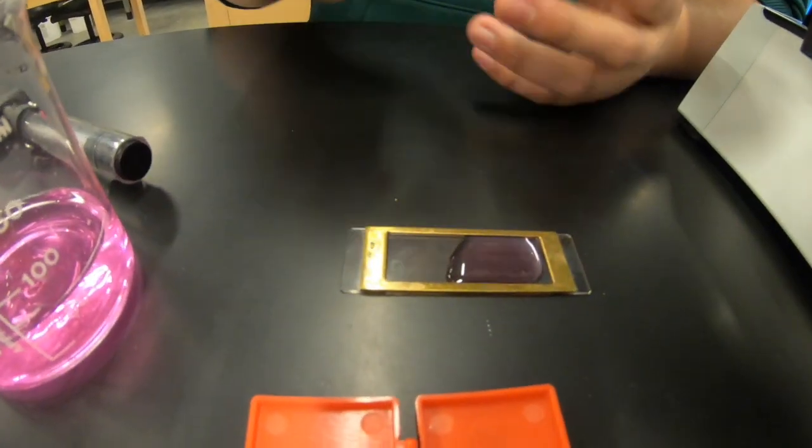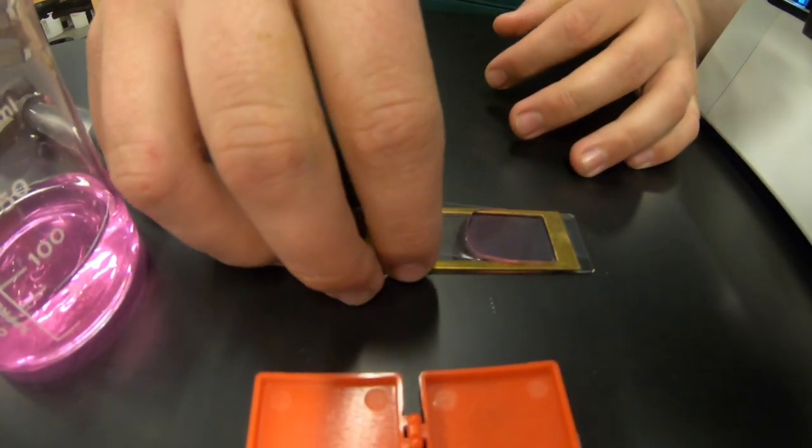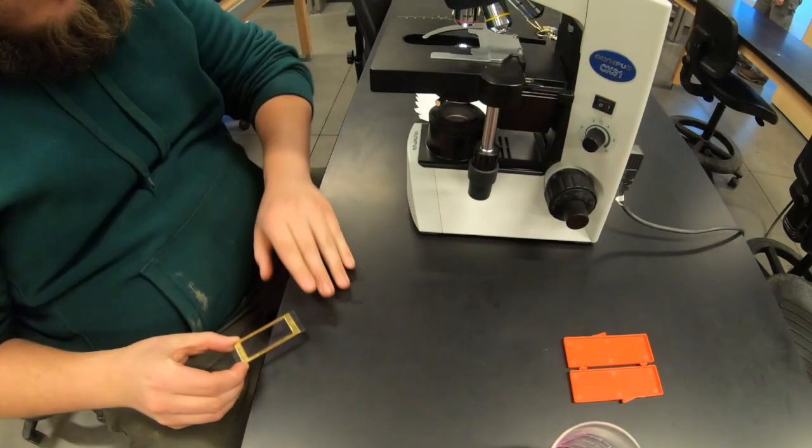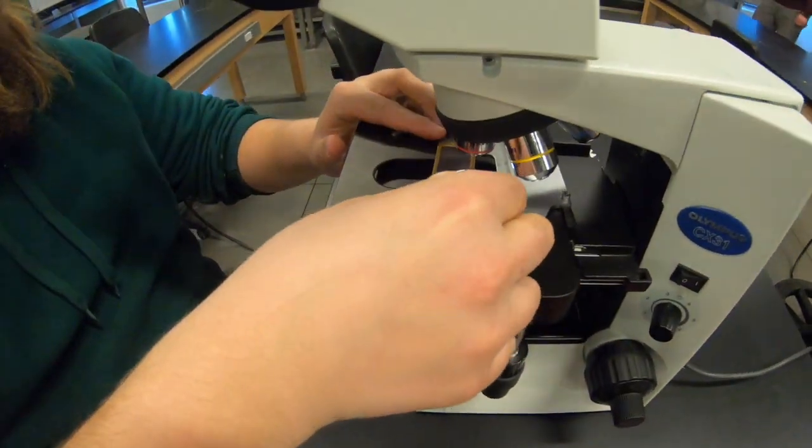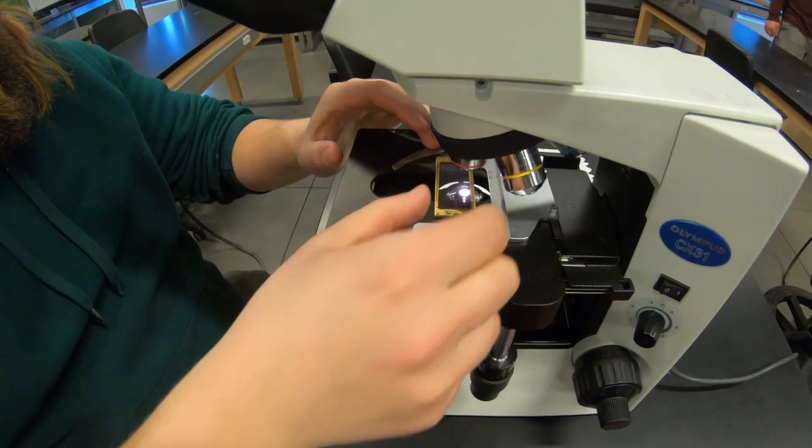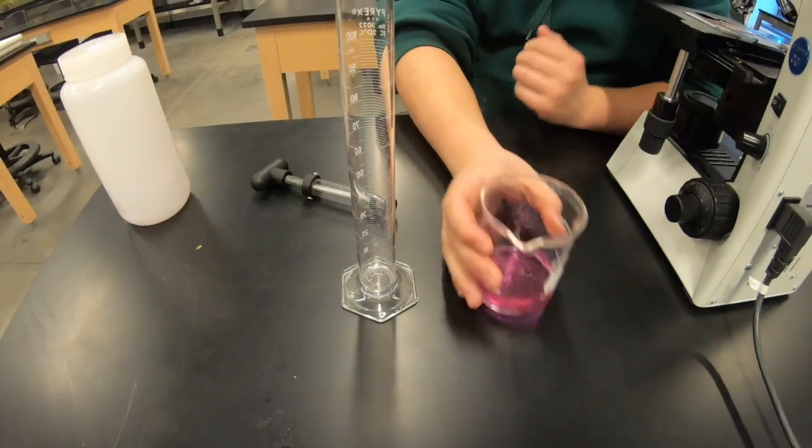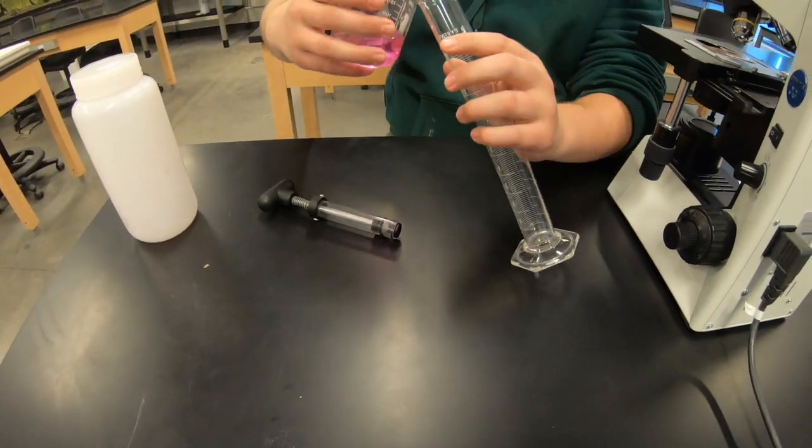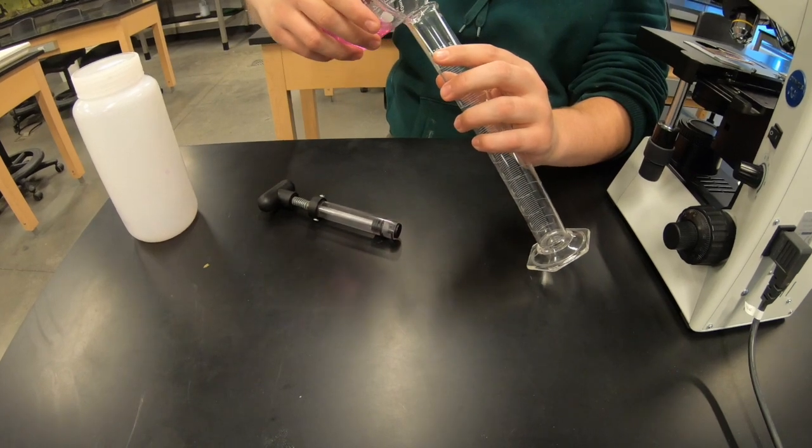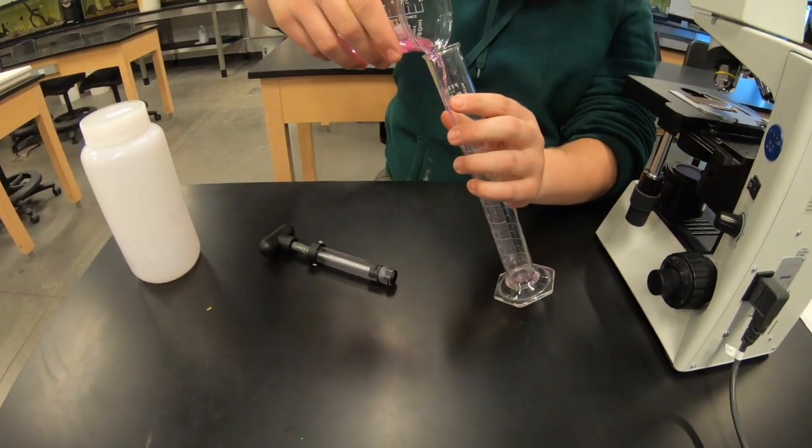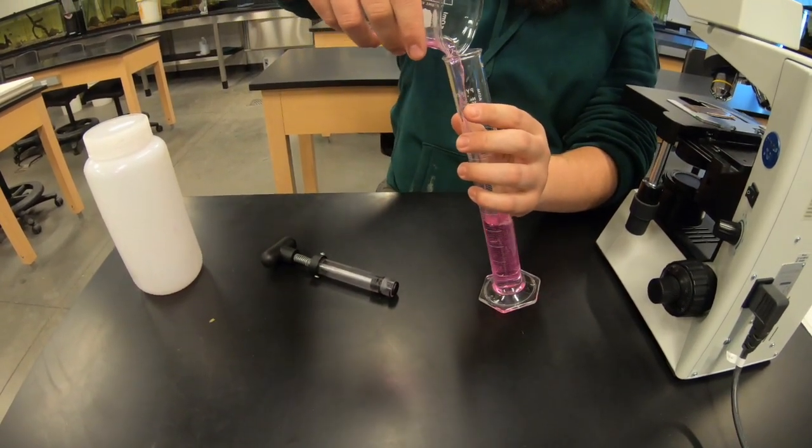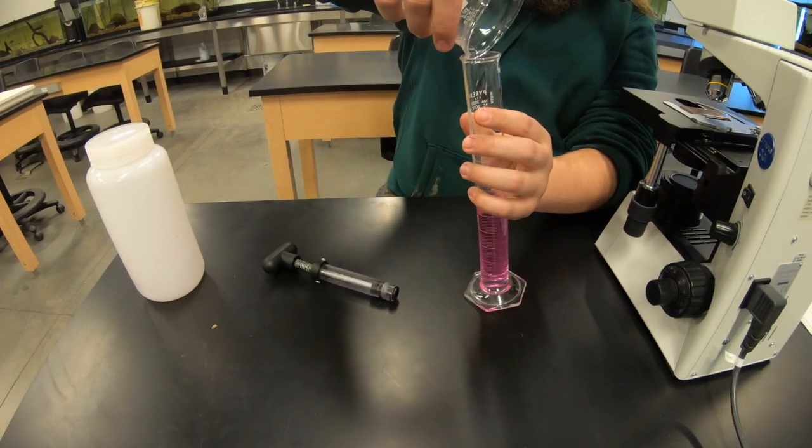Once that's on there, you're going to place your Sedgwick Rafter cell onto the microscope and look at the plankton. You're going to do this in triplicate, so we will be adding three milliliters to our total number. Here we're going to get 53, and we're going to add three to that to make it 56.